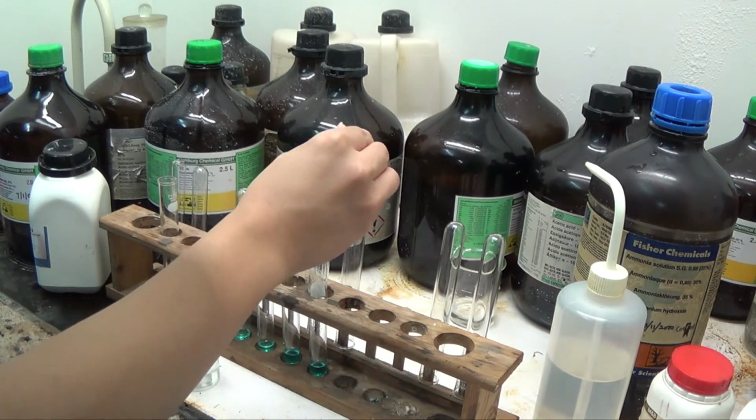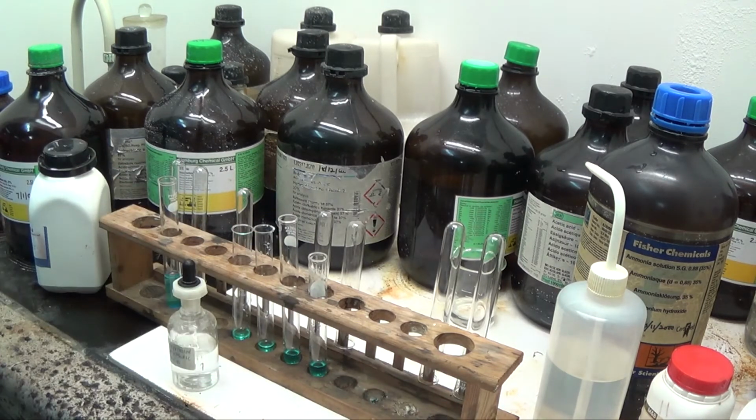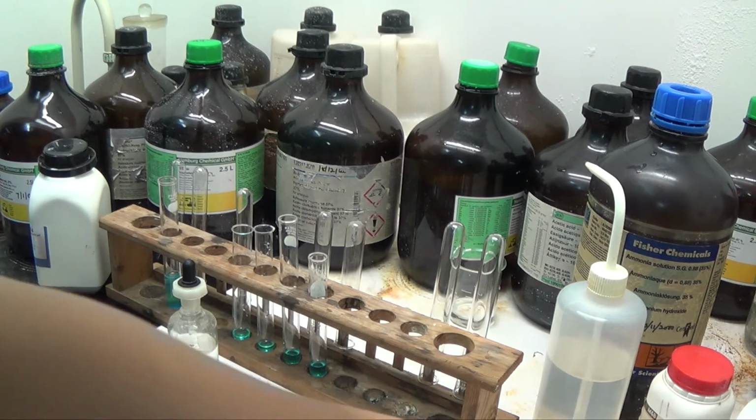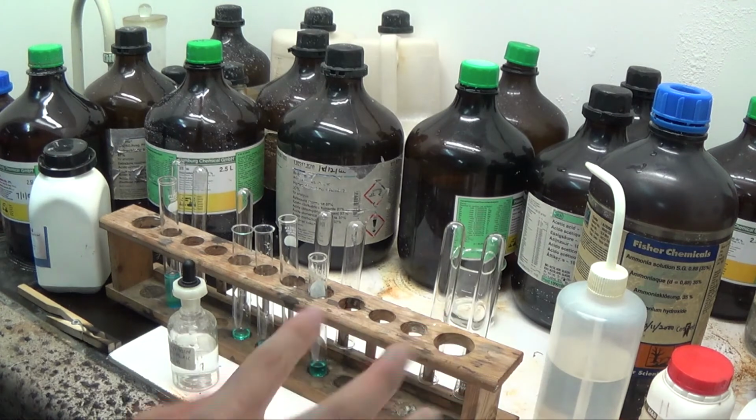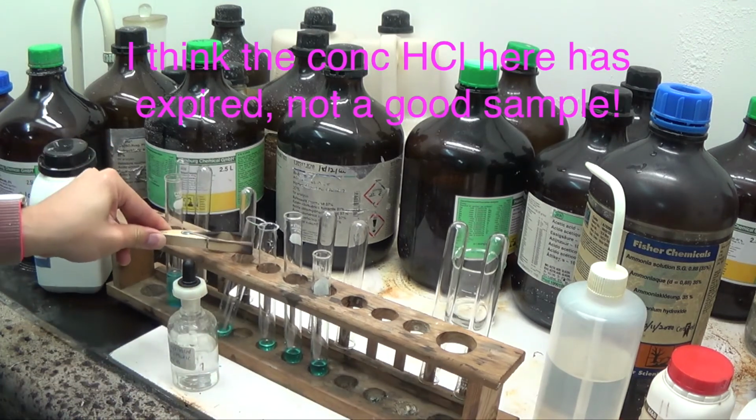Not too sure if it's clear or not. I should grab a test tube holder actually, so that I won't be holding it in my hand. Okay, so I have a test tube holder.